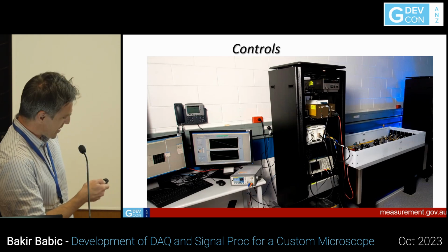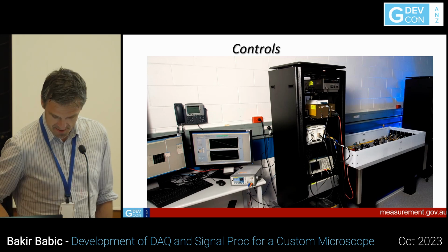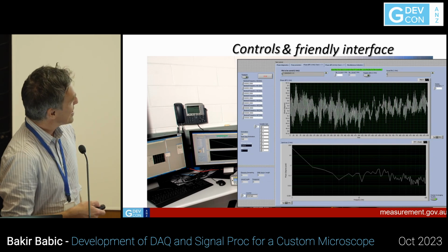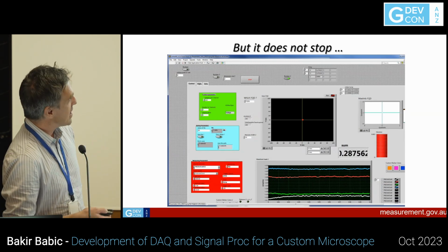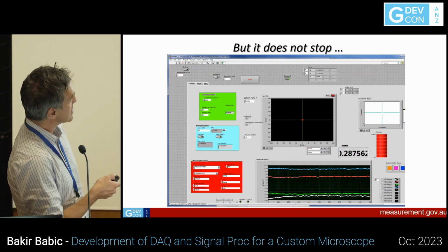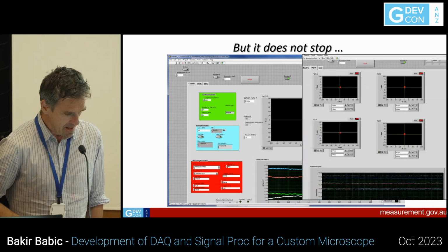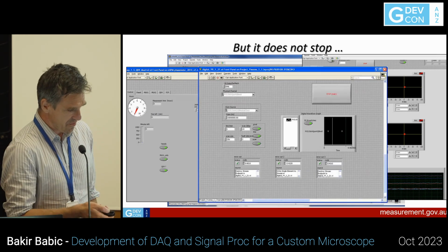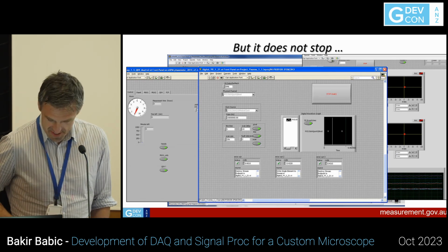This is how it looks. This is that room which contains all the controllers. This is the friendly interface for our phase meter. And then besides this, we have different things for the alignment of interferometers. Here you can see where we have these 4-quadrant detectors with our signals. And this is 4 of them. And then we have a TTL signal, which was just here for testing purposes, all this interface.